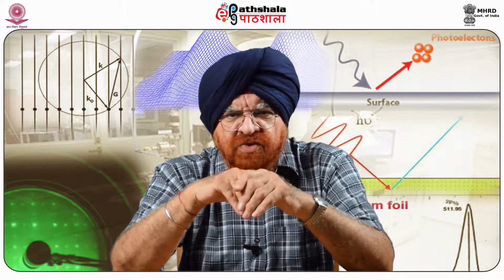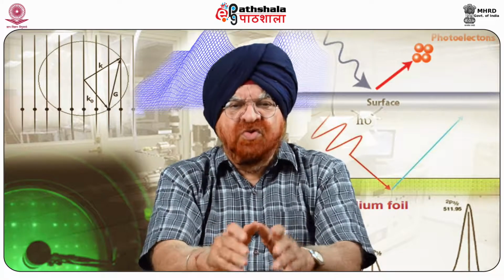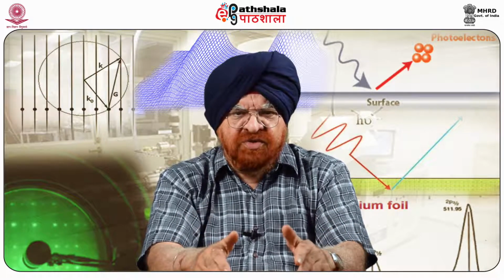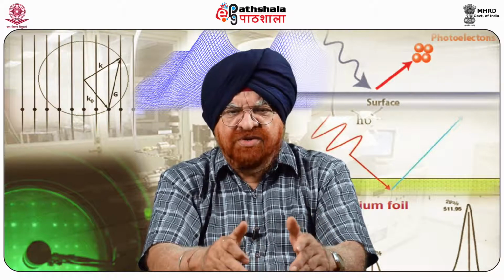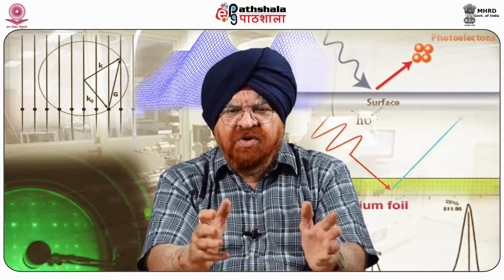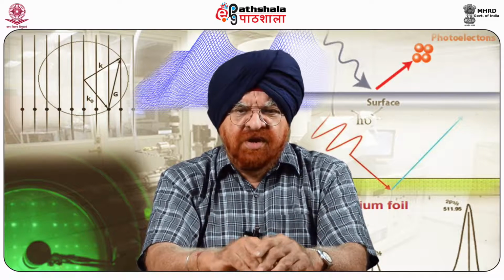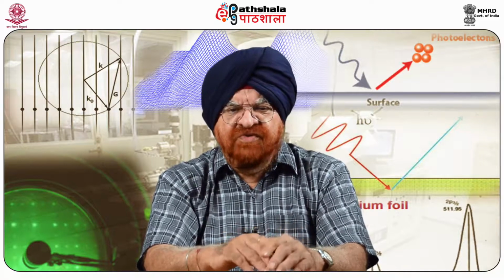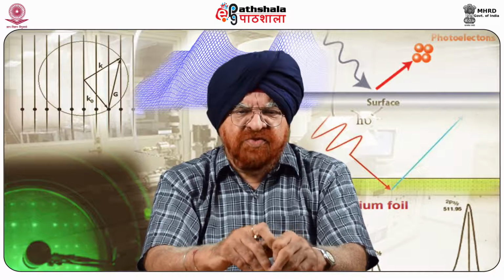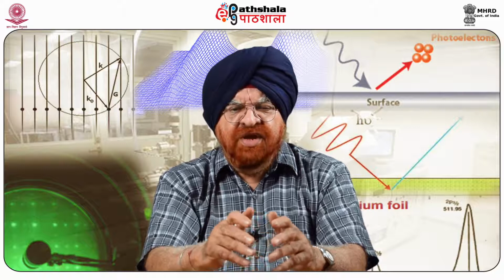The exact value of the numerical coefficient in the equation, 3/2 versus 2, is beyond the experimental uncertainty. Widths of adhesion, force distribution, plus errors in determination of K and R. Both approaches have been used to derive surface free energies from adhesion data. However, even when the work of adhesion is given more accurately by the DMT expression, the surface profile and contact area are better described by the JKR model.